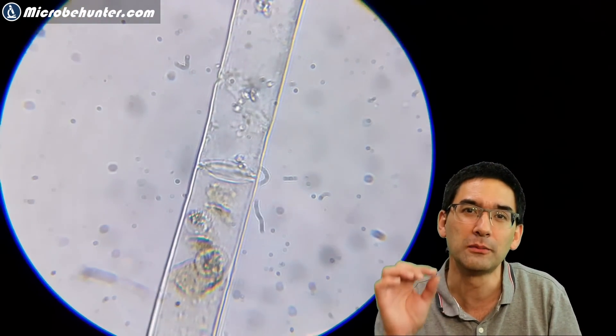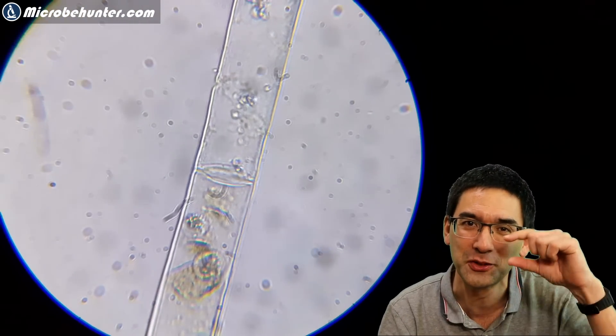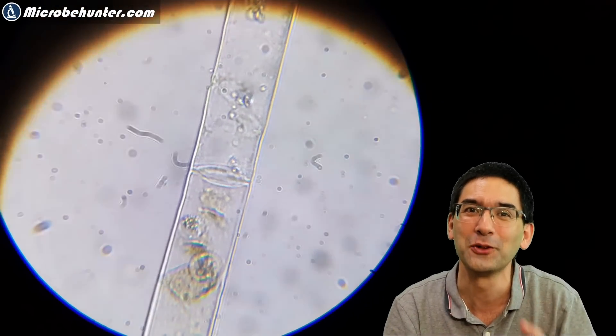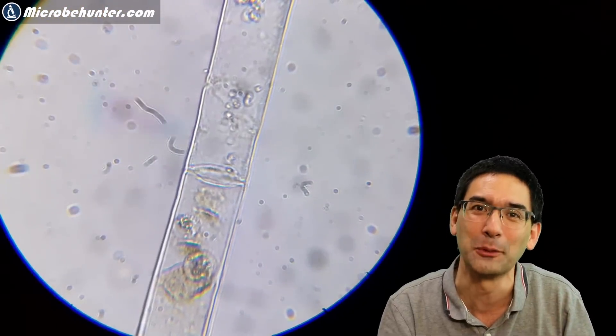Basically the dots that you see - that's all dirt on the eyepiece. So when I turn the eyepiece you can see all of the dirt also rotating around. That's not the fault of the microscope but my fault because I didn't clean it properly.